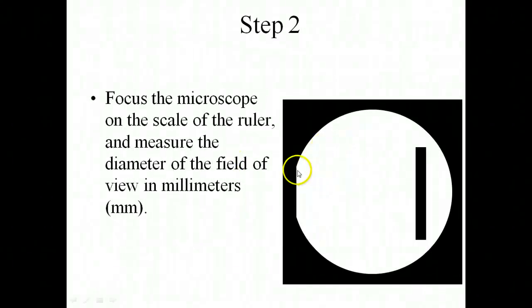When we do this, we'll be able to see the edge of one line and another complete line. So that tells me the distance between here and here would be one millimeter. So we want to know our total field of view, the distance from this edge all the way to this edge. We do have to do a little estimating because we don't know this exact distance right here.